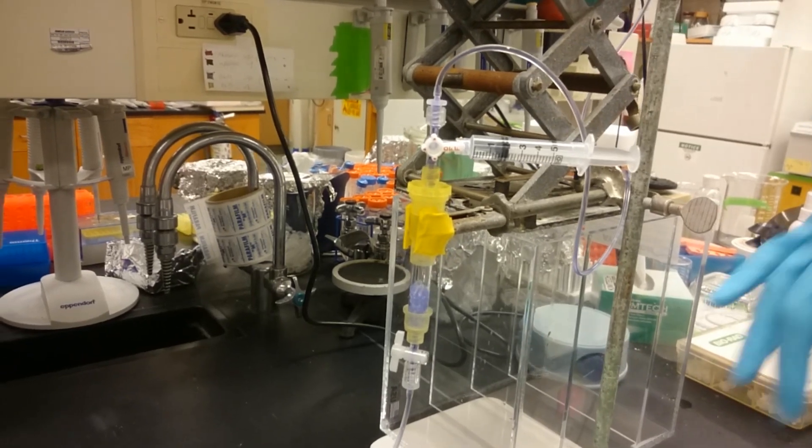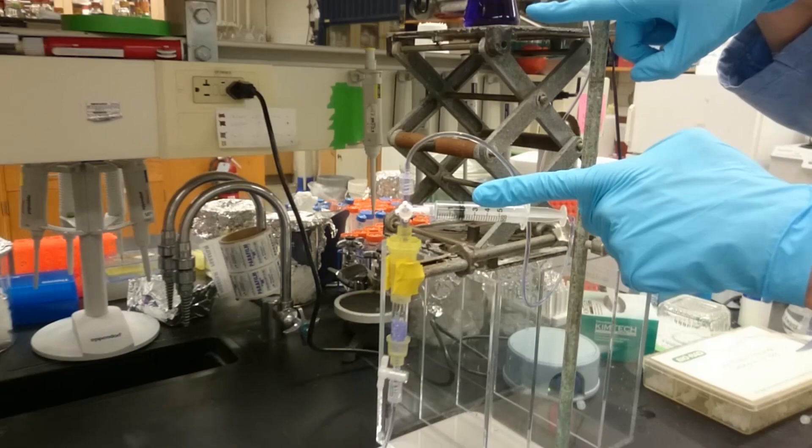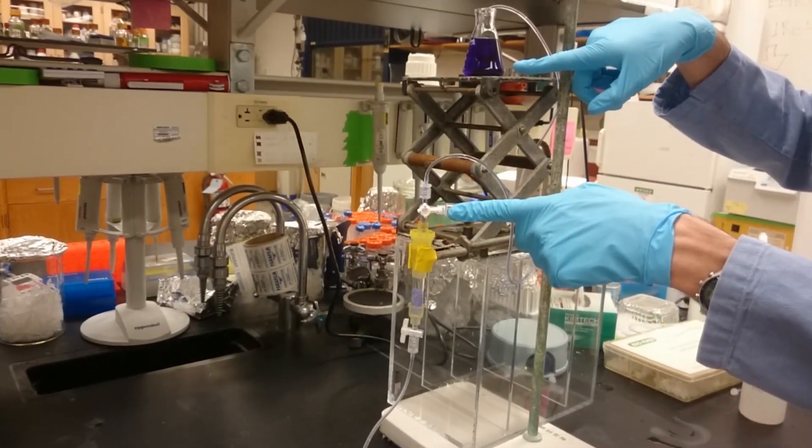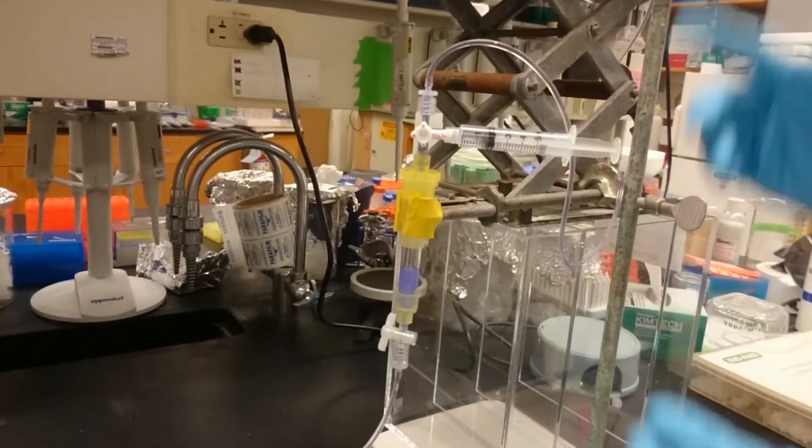The rate at which this is dripping is proportional to the vertical elevation change between the top of the column and the solvent reservoir. You can see that if I close the stopcock at the bottom, it stops running.